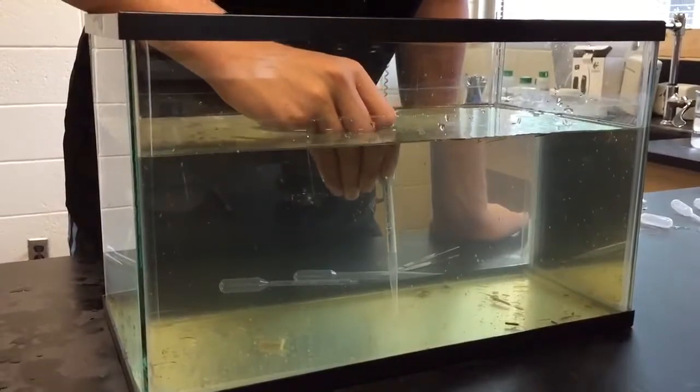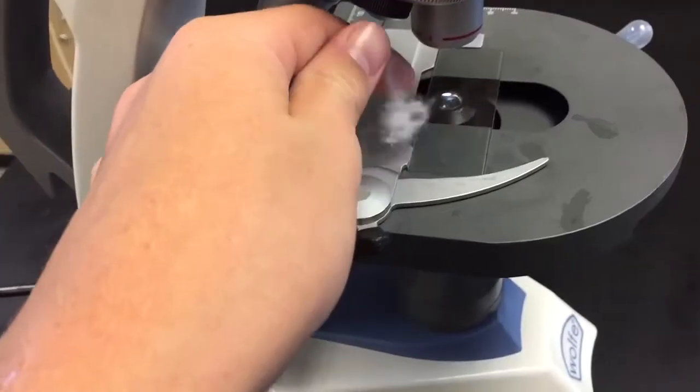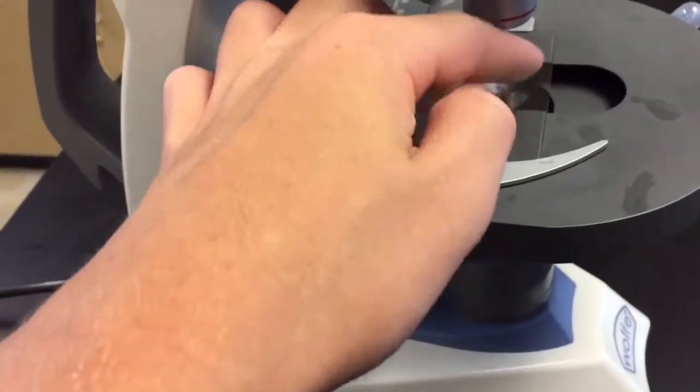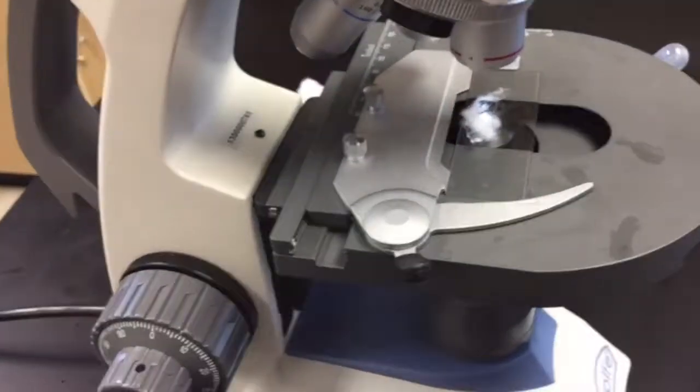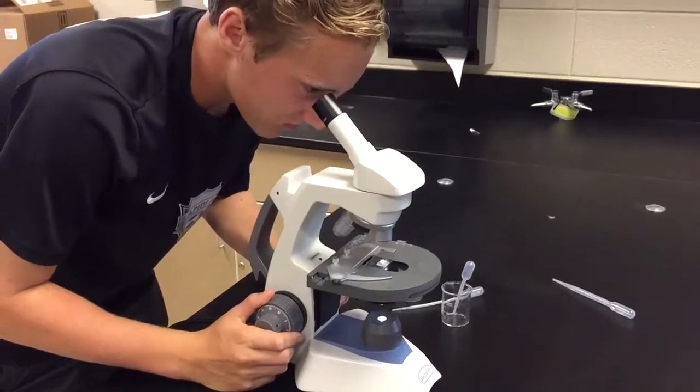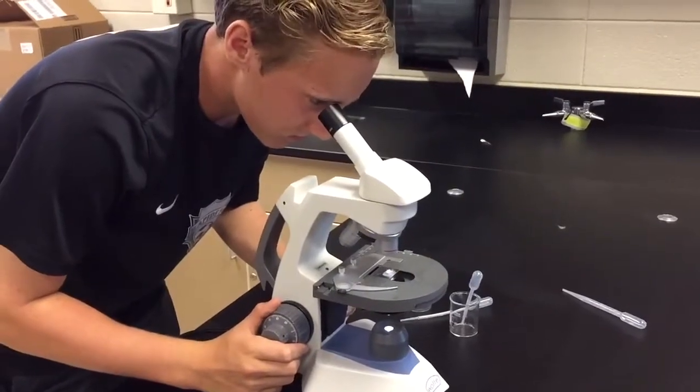Ali is trying to catch a Daphnia right now. He's got one. He's got to put the cotton onto the slide so that when the Daphnia gets on there, it can't move around. Ali is focusing in on the Daphnia so that when we count its heart rate, it will be clear.